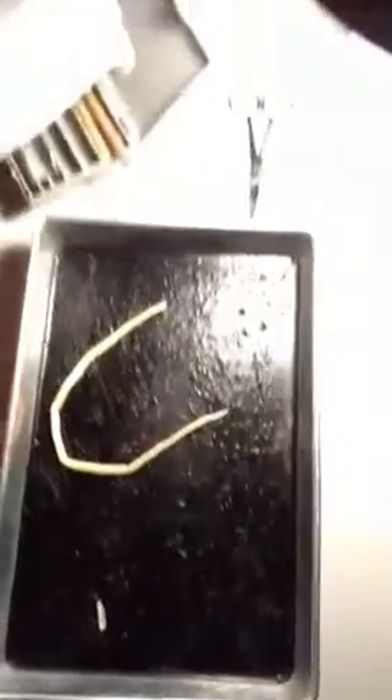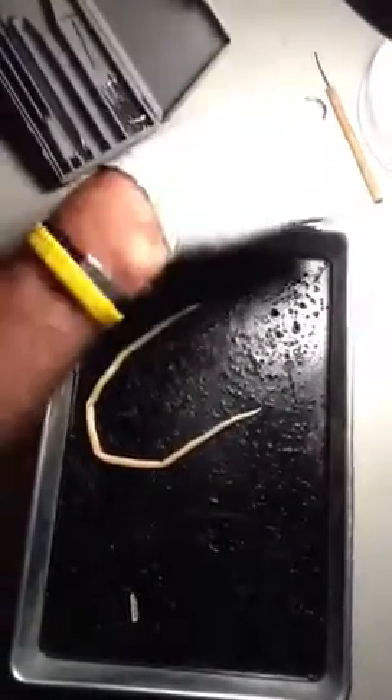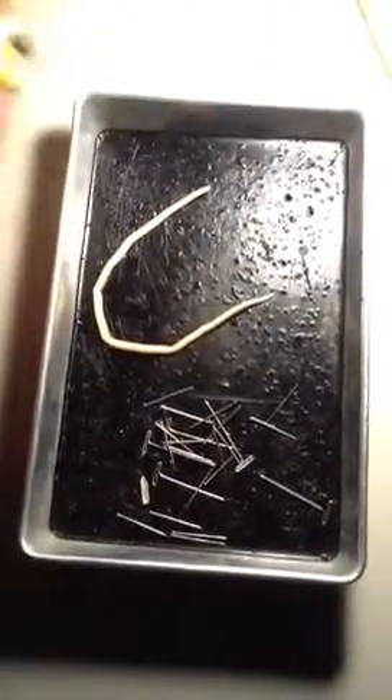First thing I'm going to do is get all the pins out. I pull up the scissors, I pull up the two probes, and then I put my hand over the rest and dump them out. There they are. Scissors back, put one of the probes back.